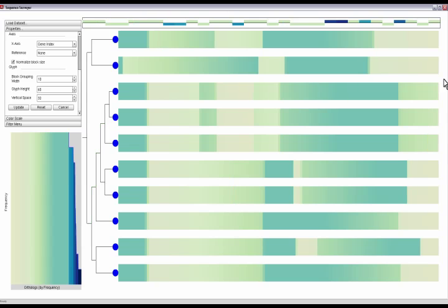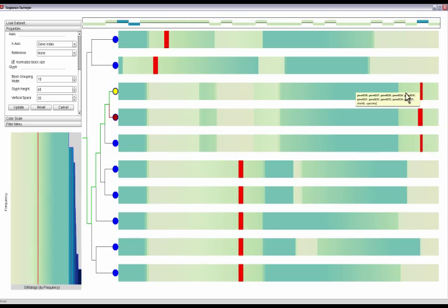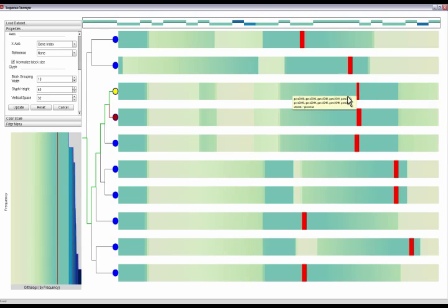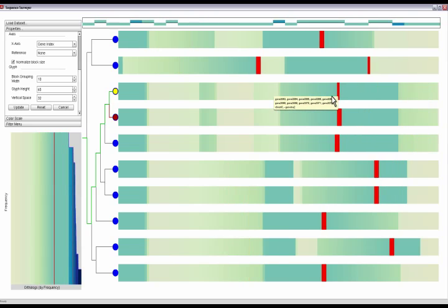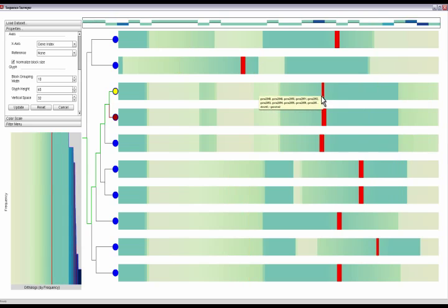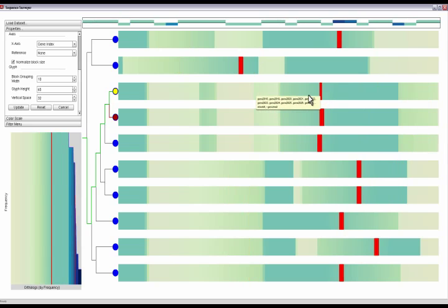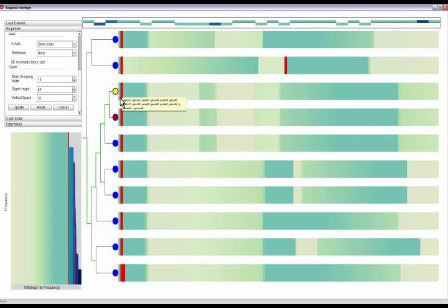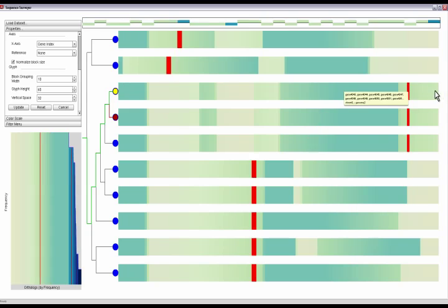Sequence Surveyor uses gene-level alignment data. Genomes are displayed as bars. Many orderings of the genes within the genome are available. Here, genes are ordered by their position in each genome, beginning to the left and end to the right.